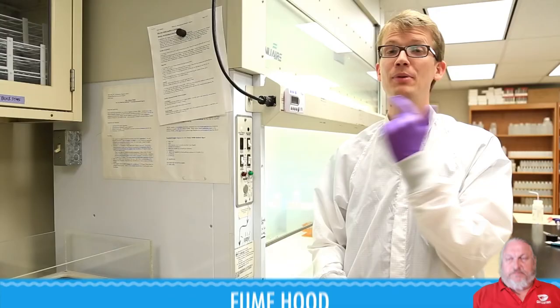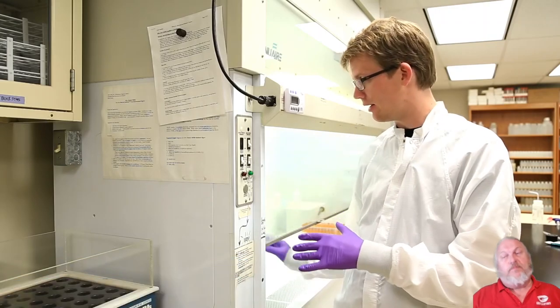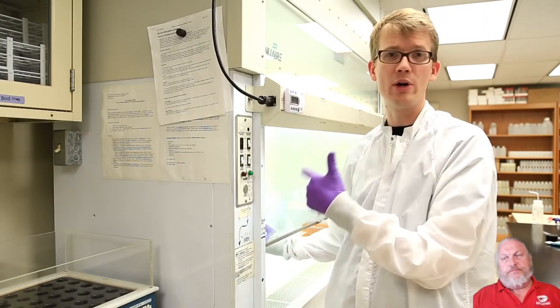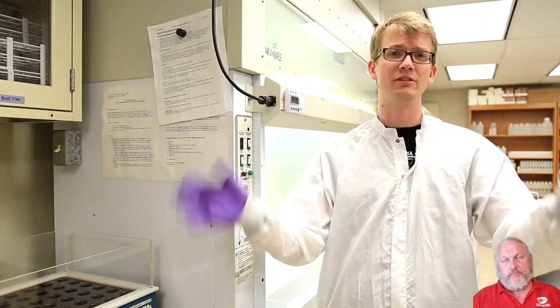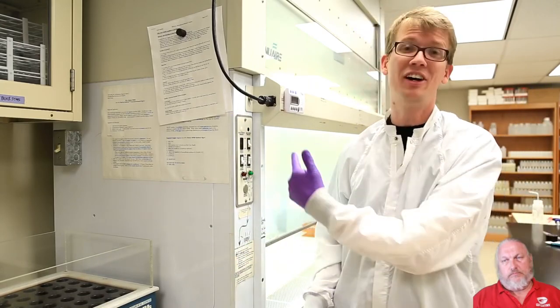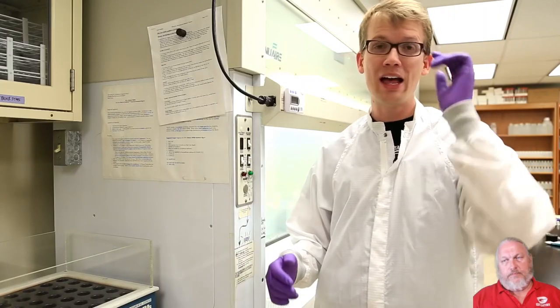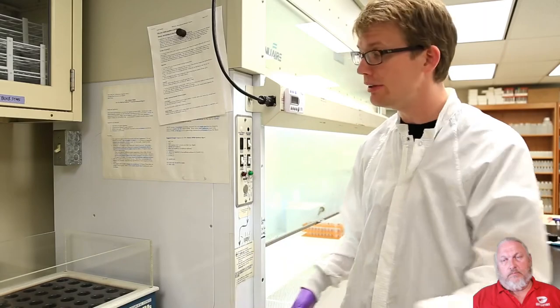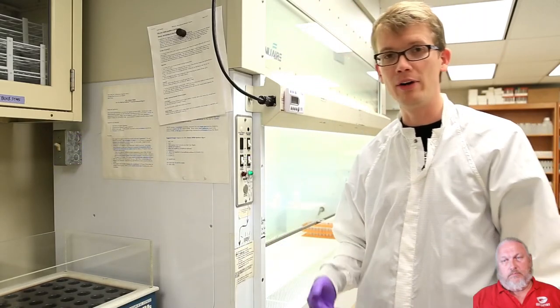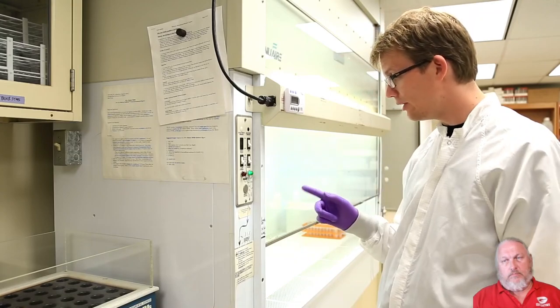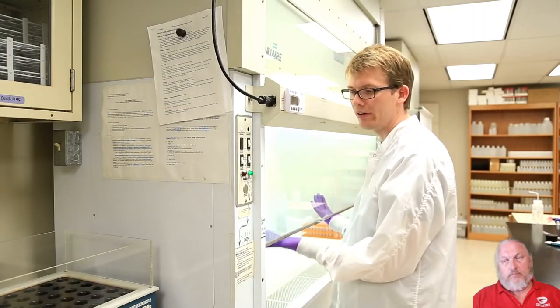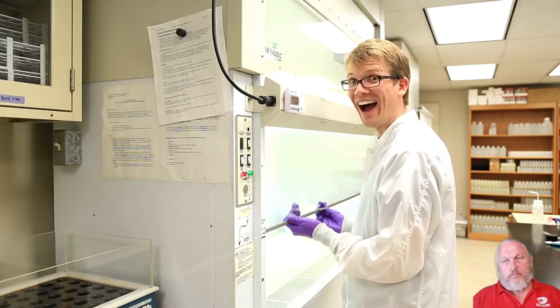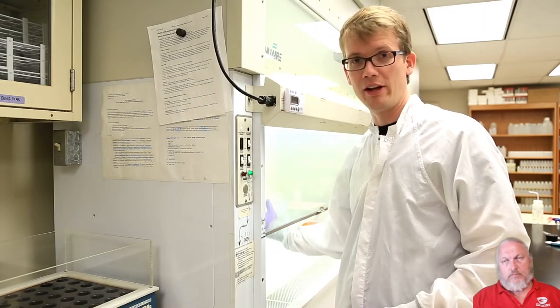Also you should probably assume that every liquid in a lab that is not water is flammable. This baby here is a fume hood. It sucks all the air in there out so you don't have to breathe whatever's going on in there. It's also why it's impossible to keep chemistry labs at the proper temperature, because the AC units and heating units are constantly pumping in controlled air and these are constantly sucking it out. So if you're doing some chemistry that might contain some noxious fumes, that goes on in here. And if you want it to work properly, first you got to turn it on. That's the vent, that's the blower. Now it is sucking air. Second thing you want to do is make sure the sash is at the right level. This has a little thing that tells you where the sash is supposed to go. If you go above that on this model it'll buzz at you. If the sash is higher than that, it's not gonna properly vent all the stuff to the outside and some of it might get into your face and that would be bad.